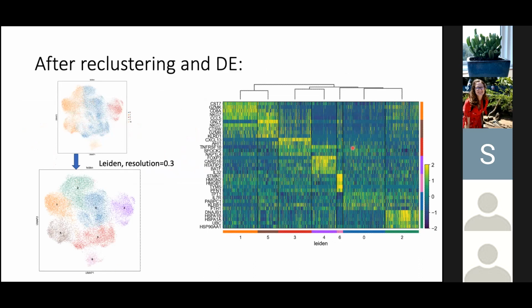And then you can redo a heat map. And the heat map here is actually relatively okay, right? You can see that you basically have your CD8 positive and your NK cells hanging around here. And then you have, I don't know what the rest of this graph is off the top of my head. But I think, oh, these are your Tregs. So this kind of works.